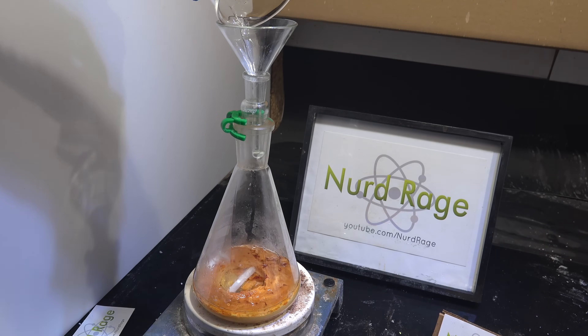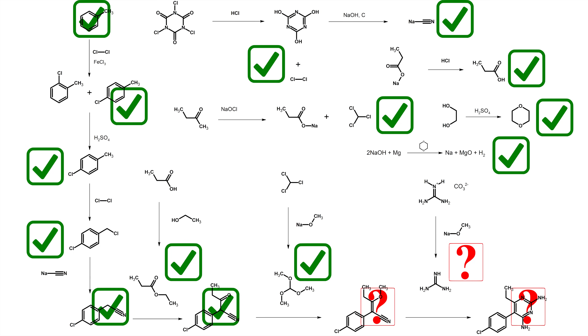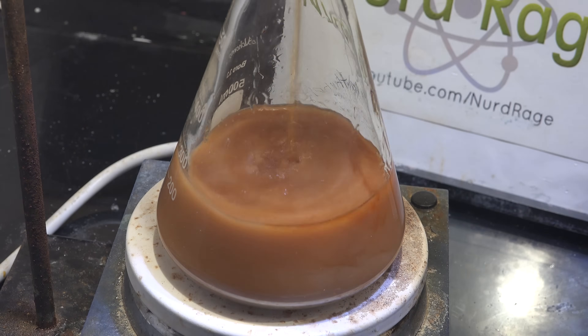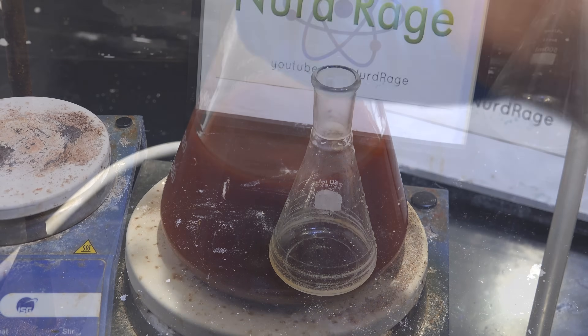Greetings, fellow nerds. In previous videos we've been making the precursors to pyrimethamine and have so far gotten up to step 5 on the main route. In this video we're pulling out all the stops and plowing through both step 6 and 7 to finish and finally produce pyrimethamine after two years of work. Let's get started.